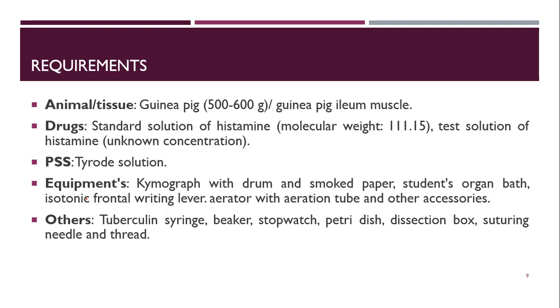Some other requirements are a tuberculin syringe, beaker, stopwatch, petri dish, dissection box, suturing needle, and thread. Okay, so the general requirements are these.